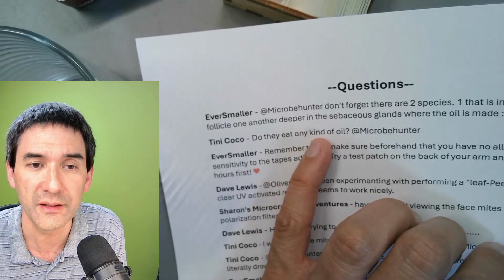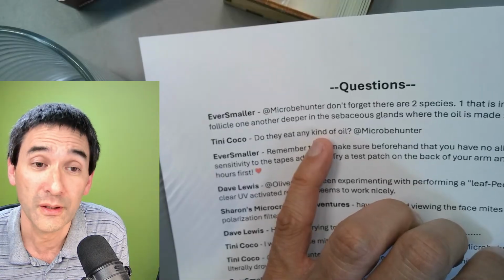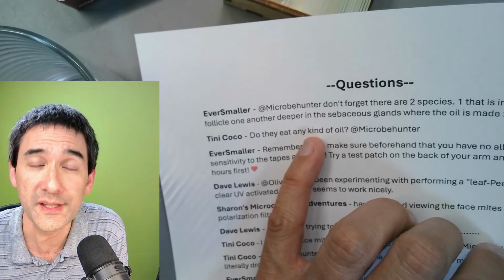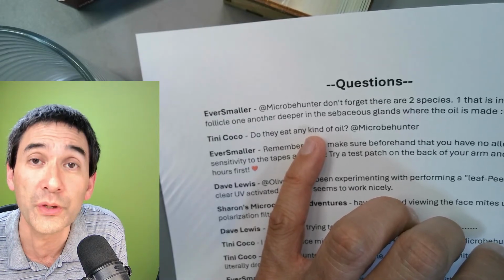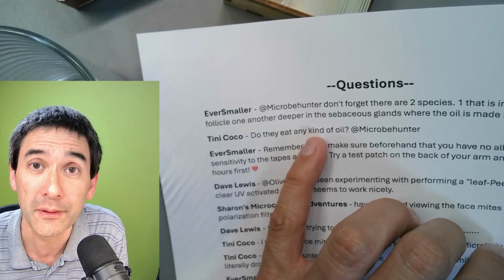Of course, the oil that is present in the skin is the one that they're optimized to metabolize. The reason why I added vegetable oil is because this way the glue dissolves off the tape, and they can be more easily removed from the tape.